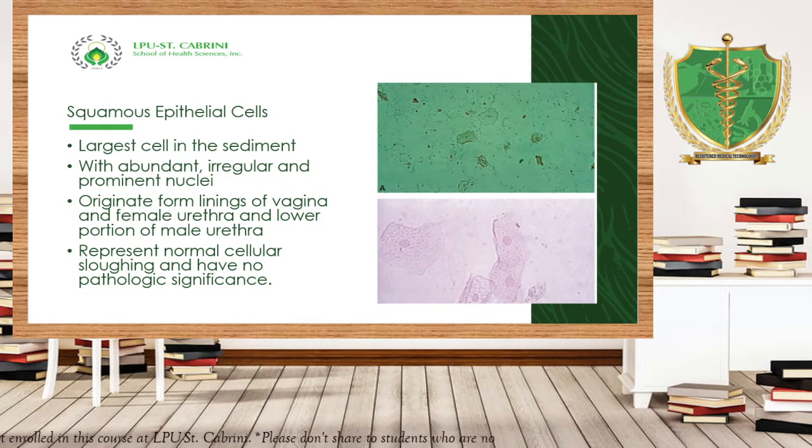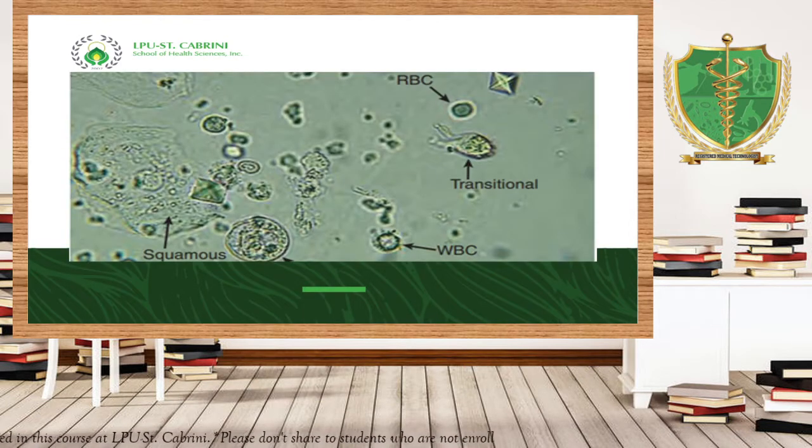Squamous epithelial cells are considered not significant or not pathological. However, the presence of squamous epithelial cells with ingested microorganisms on the cytoplasm is an indication of bacterial infection, vaginal bacterial infection, Gardnerella vaginalis. Okay, that is called clue cells.